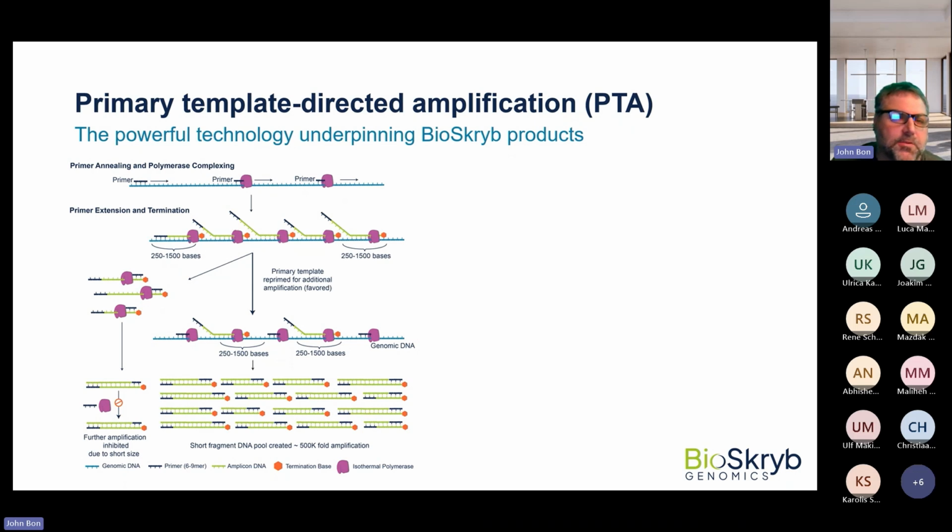They're random primers. It's not like PCR where you use opposing primers. So we use random primers that'll interrogate the whole human genome. I do want you to realize that it'll also amplify bacterial genomes or mitochondrial genomes. So in that human cell that has mitochondria, you'll also get the mitochondrial DNA amplified. And with ResolveOME, you'll get the mitochondrial RNA as well. So just be aware of that.